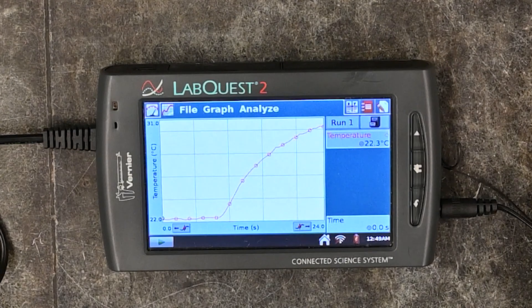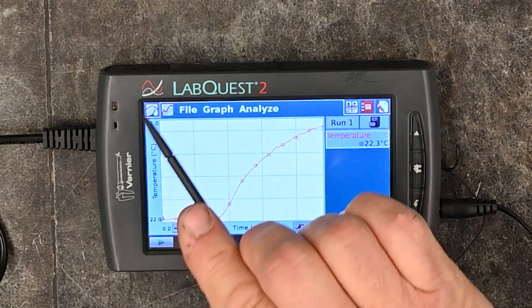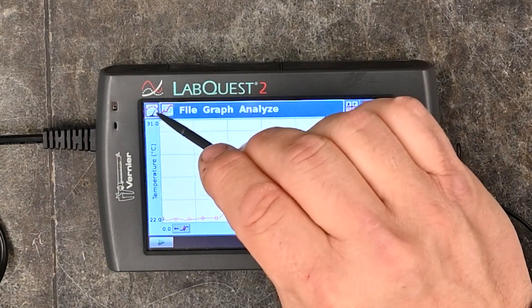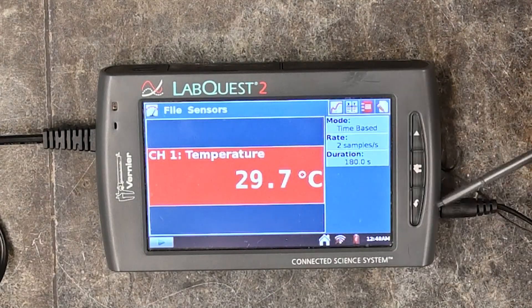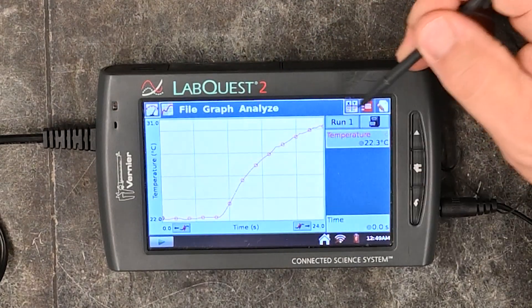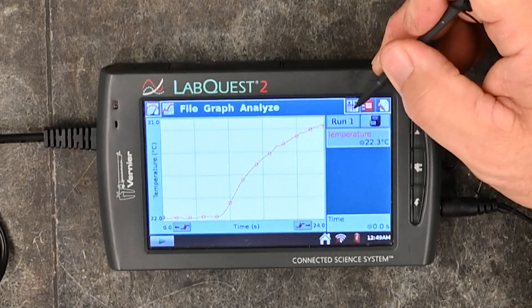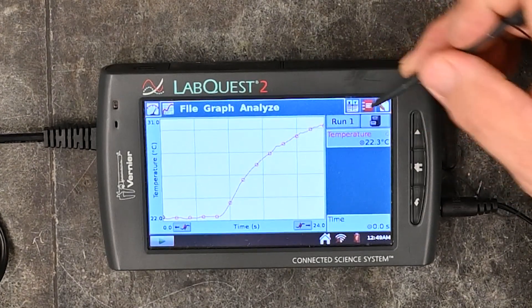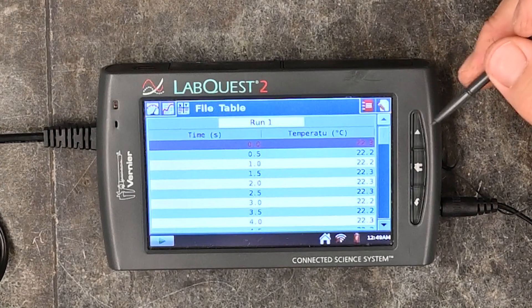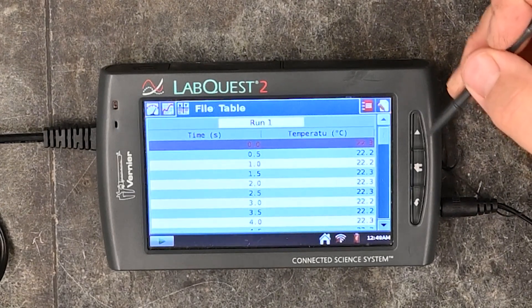You'll see that it auto-scales right away once you're done. The first tab at the top shows what is currently happening with the sensor. The second tab across the top is for the graph, and the next one is for the table, so if you want to look at your raw data you can do that there.